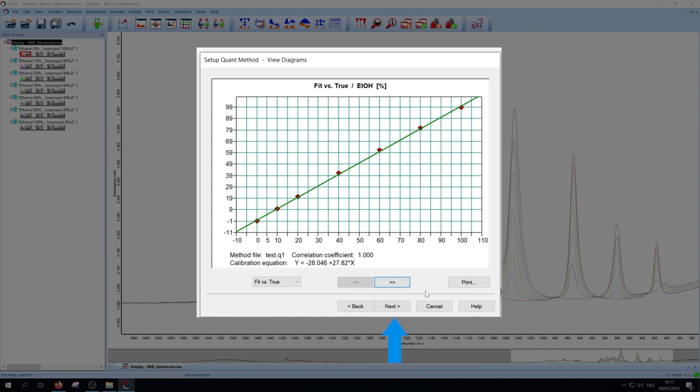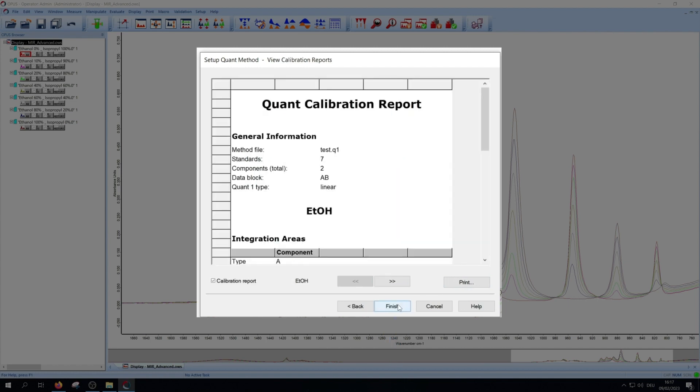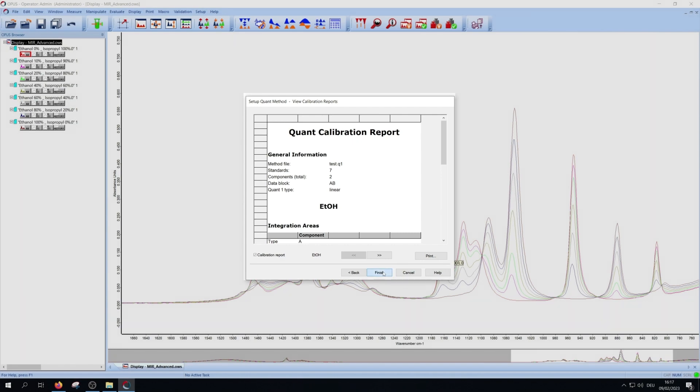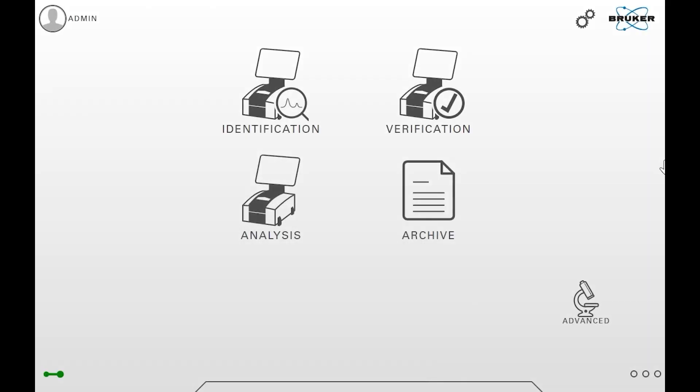Press next for quant calibration report. You can print this as well. Now we're done with the setup. Press finish to close the window. The method is now ready to use.